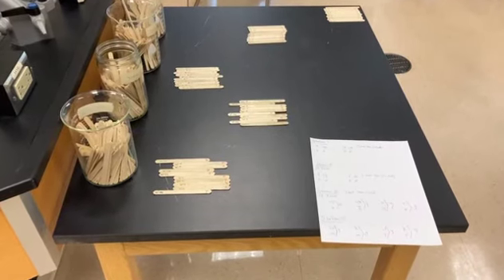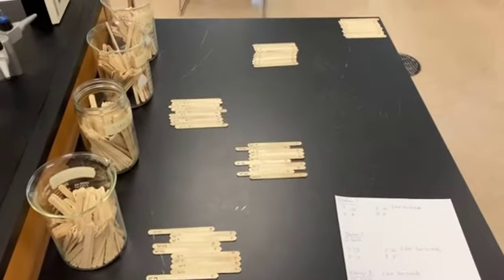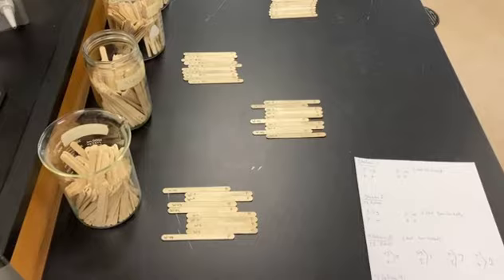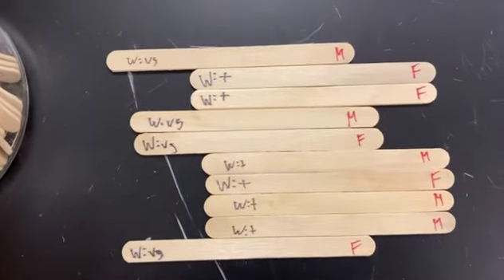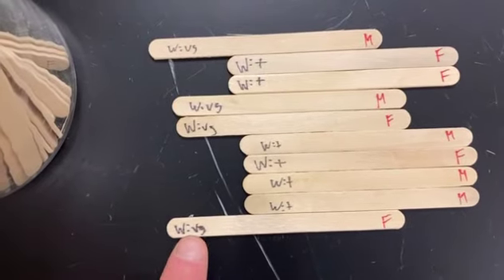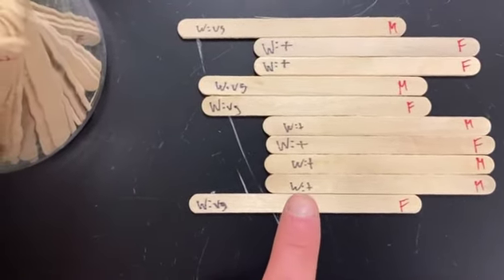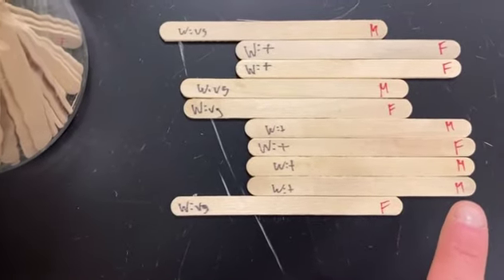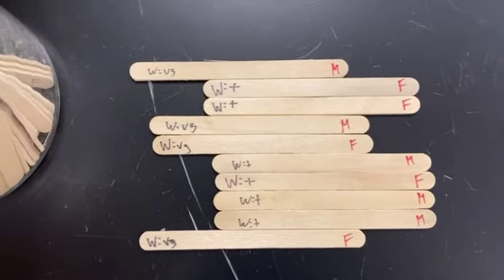All right, so I finished laying out all the popsicle sticks and our counts. So let's take a look at our data and then how we summarized it. For station 1, we see that we pulled some vestigial winged females and wild-type winged males. Looking back at the sheet, we know that wings are not sex-linked.